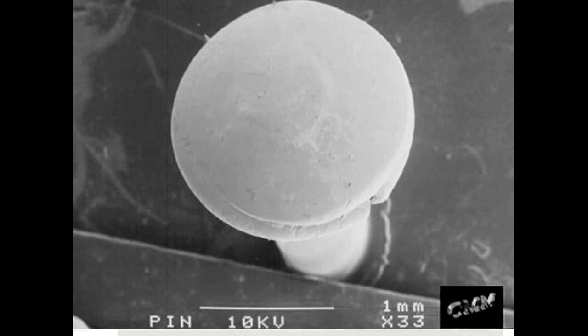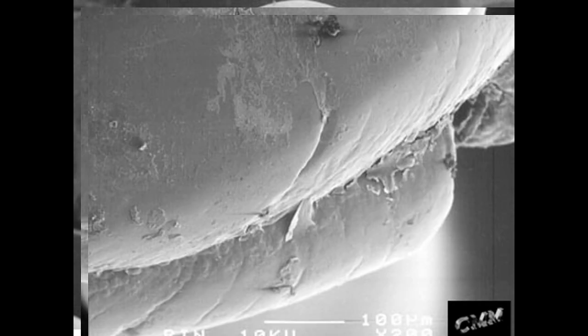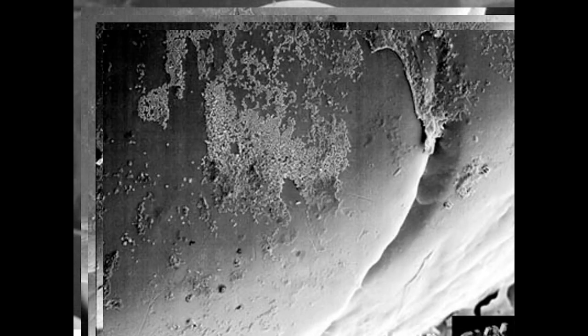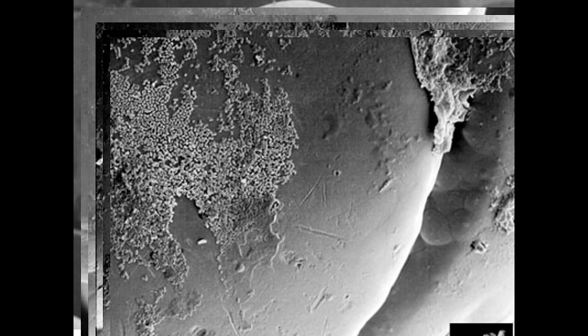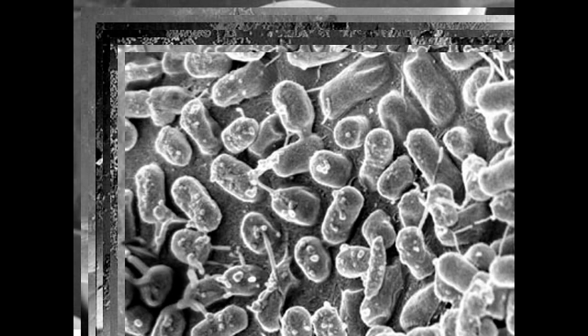This here is actually the head of a pin. And we're going to use some extreme microscopy skills to zoom in on some stuff. So you can see here, we're pretty far away. We're zooming in a lot closer and closer still. Are you starting to see something yet? Check it out. We've got some bacteria that are hanging out on there. We're getting closer and closer and closer. And when we're right up close, you can see that we have bacteria with bacteria on them. They've got some little piggybackers that have hitched a ride to wherever these folks are going.